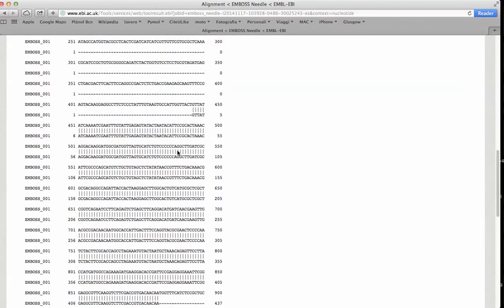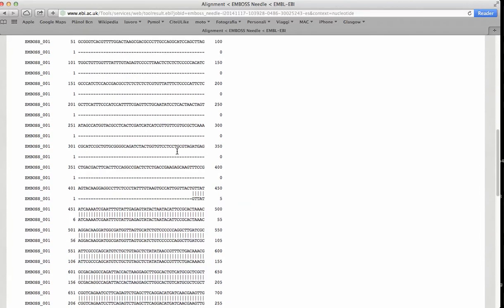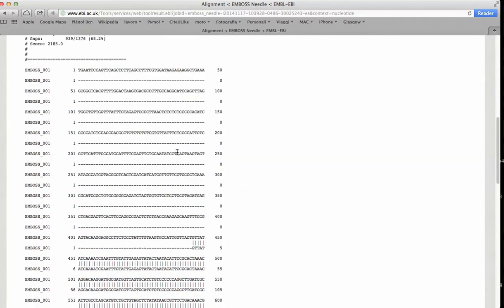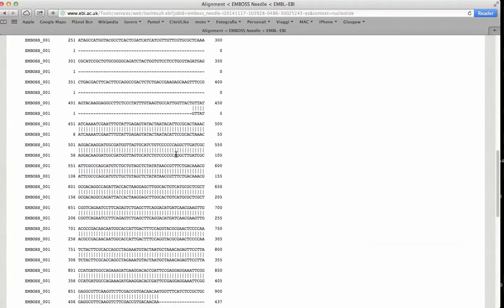But one sequence is larger than the other. This actually corresponds to a comparison of the coding region of the calmodulin gene with a partial fragment of the gene.